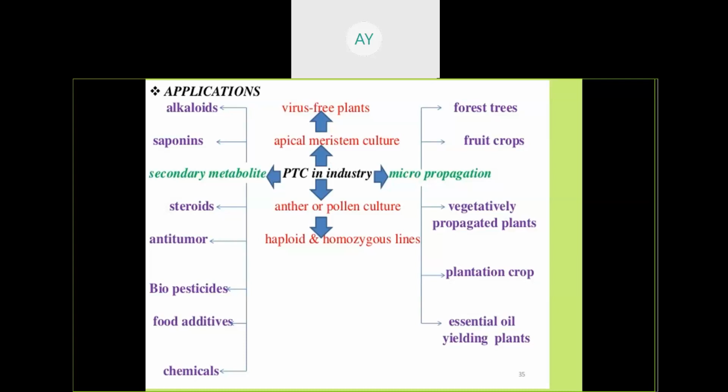Okay, so the main pathway through which the virus affects the plant part is xylem and phloem, but this xylem and phloem does not reach up to the terminal apex portion of the stem or leaf. So that's why there is no chance of infection of that terminal end, and we cut a 1 millimeter length of this plant that is free from virus and use it as explant for multiplication of the plant. So first point, the xylem and phloem do not reach up to the terminal end.